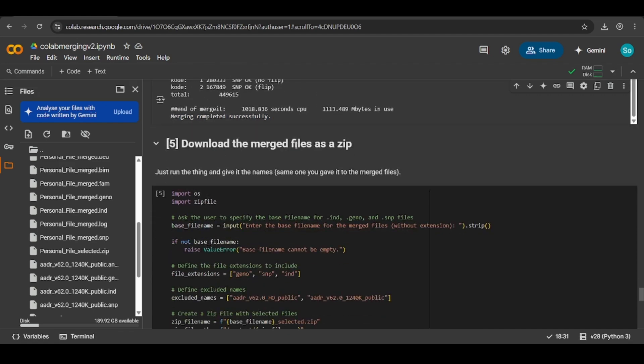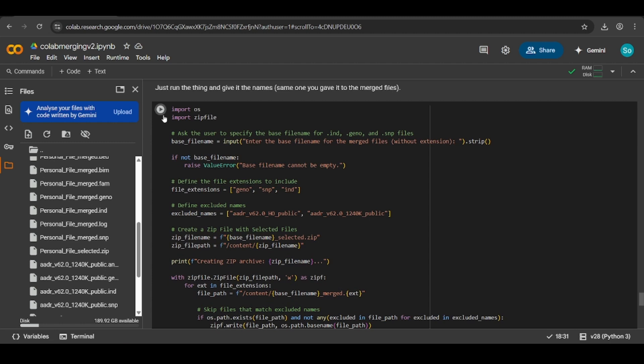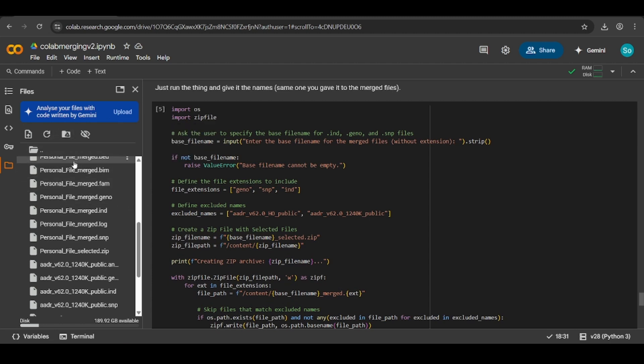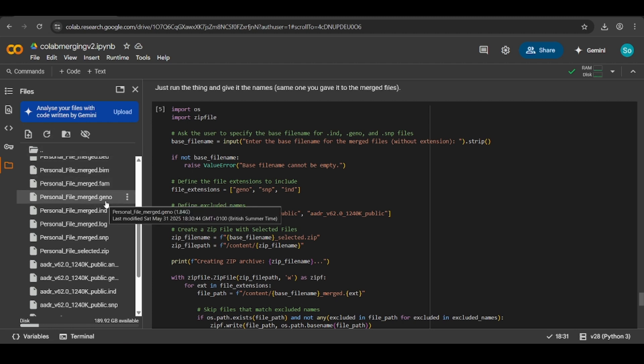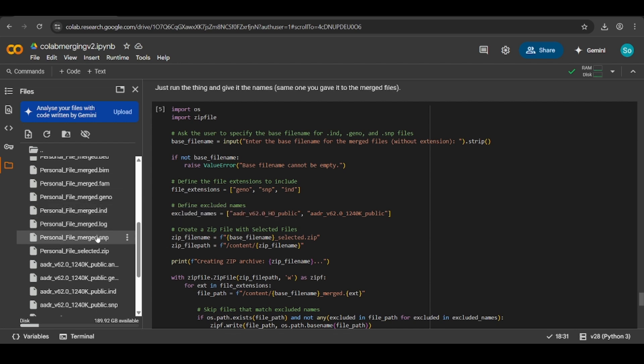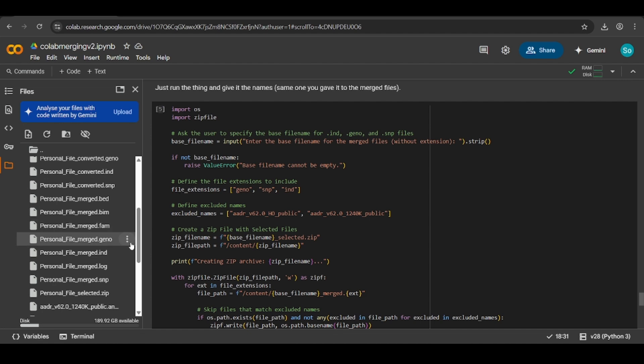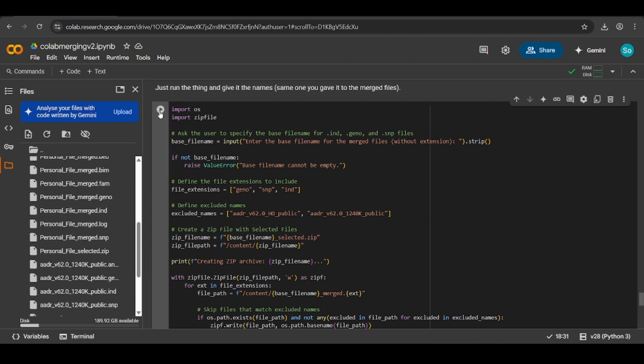Now you want to download the merged files as a zip. Before you hit play, make sure you refresh and find your files in the files folder. You will want personal file merge .geno, .ind, and .snp. These three files you need to run this off. So what you do is you hit play.